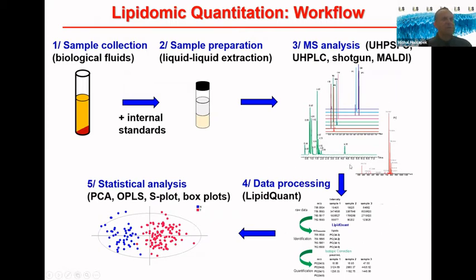Then a very difficult and time-demanding part is data processing. We are using our own software, which is freely available, called LipidQuant. And finally, the statistical evaluation using advanced tools of multivariate data analysis.